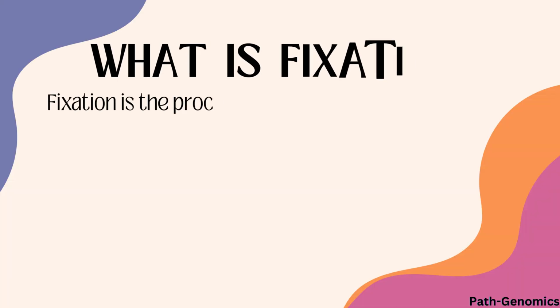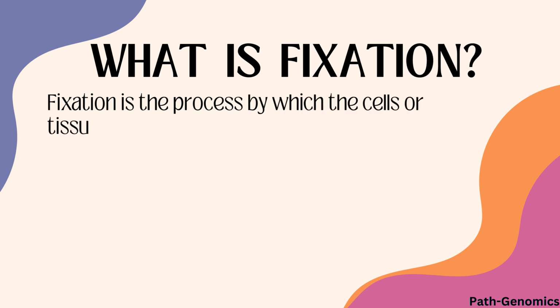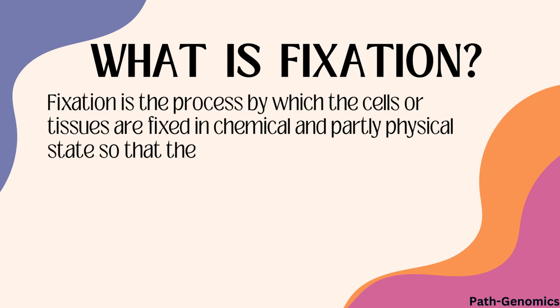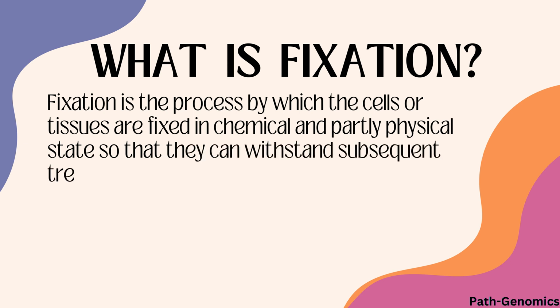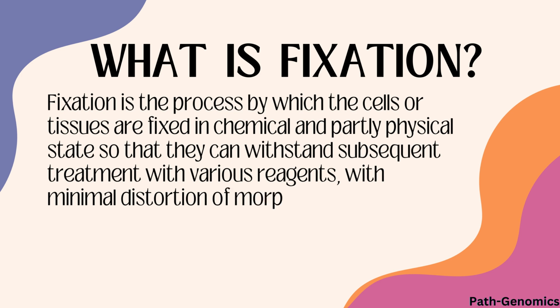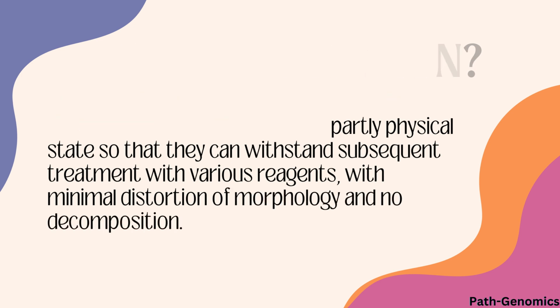First, let us know what fixation is. Fixation is the process by which the cells or tissues are fixed in chemical and partly physical states so that they can withstand subsequent treatment with various reagents, with minimal distortion of morphology and no decomposition.